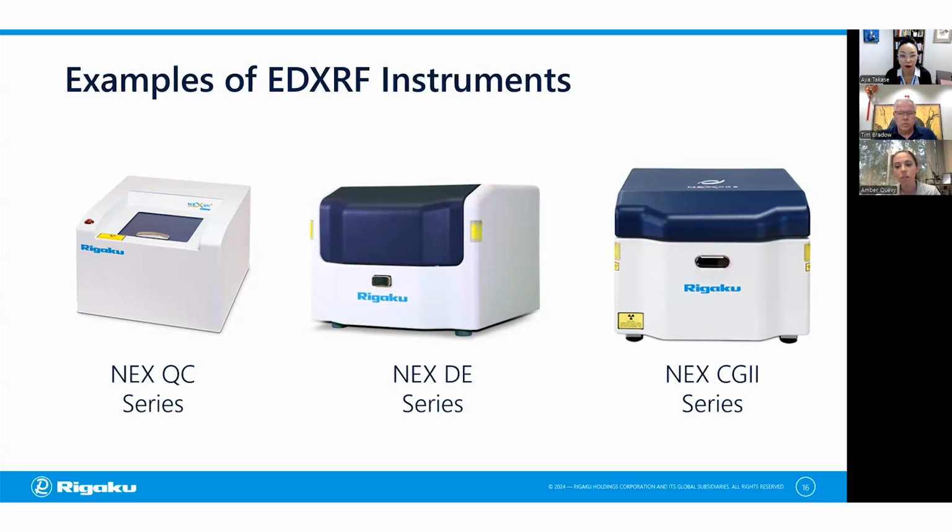We typically refer to these instruments as plug and play, as they don't require a lot of space for setup and they don't require a lot to get them up and running quickly. So these can typically be set up by the operator with no need for additional service or support.